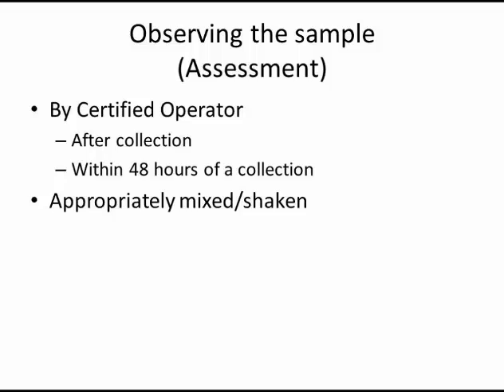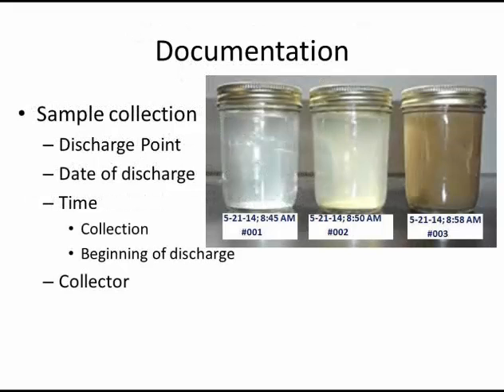If the certified operator was not available at the time of the collection, the assessment of the properly stored sample will need to be conducted within 48 hours of collection. To conduct the visual assessment, the certified operator will need to gently shake or mix the sample before conducting the assessment. When the stormwater samples are collected from each discharge point, be sure to label the samples.